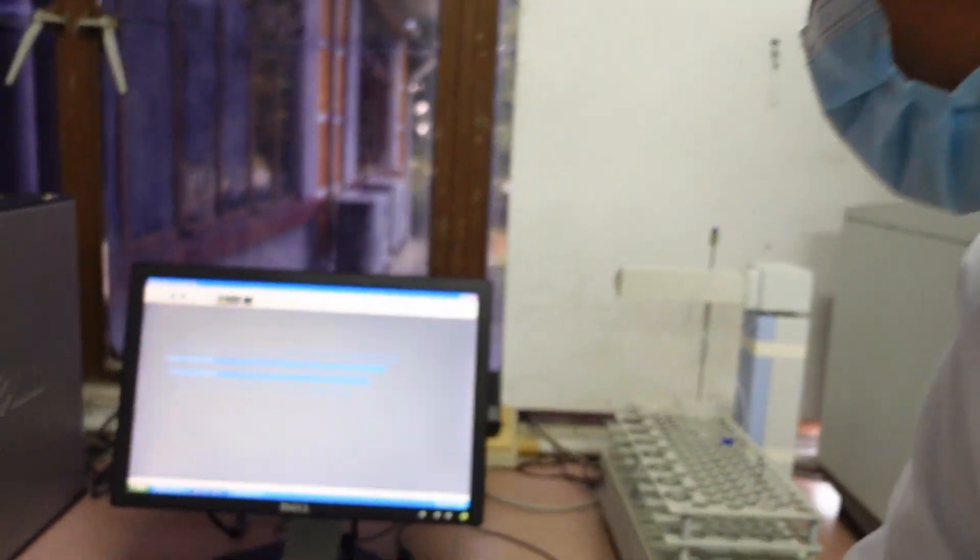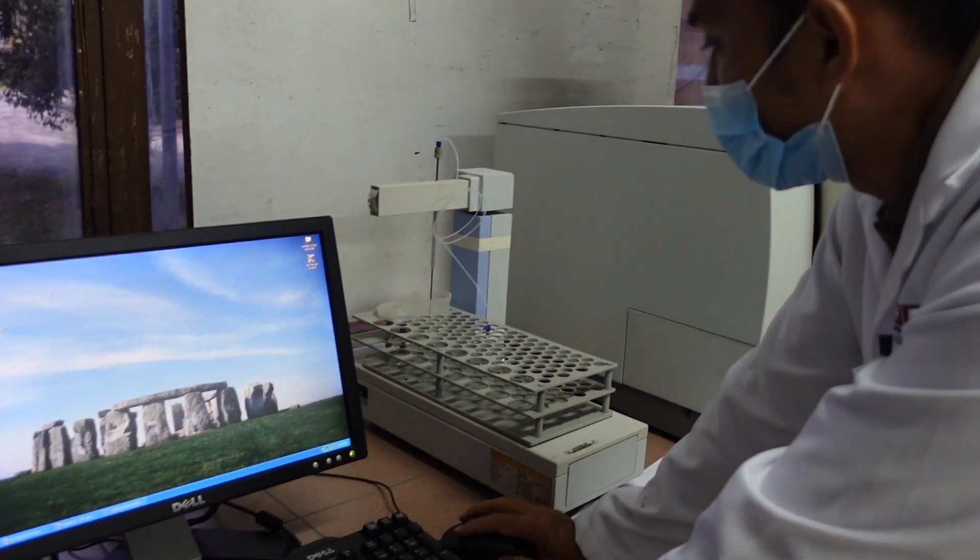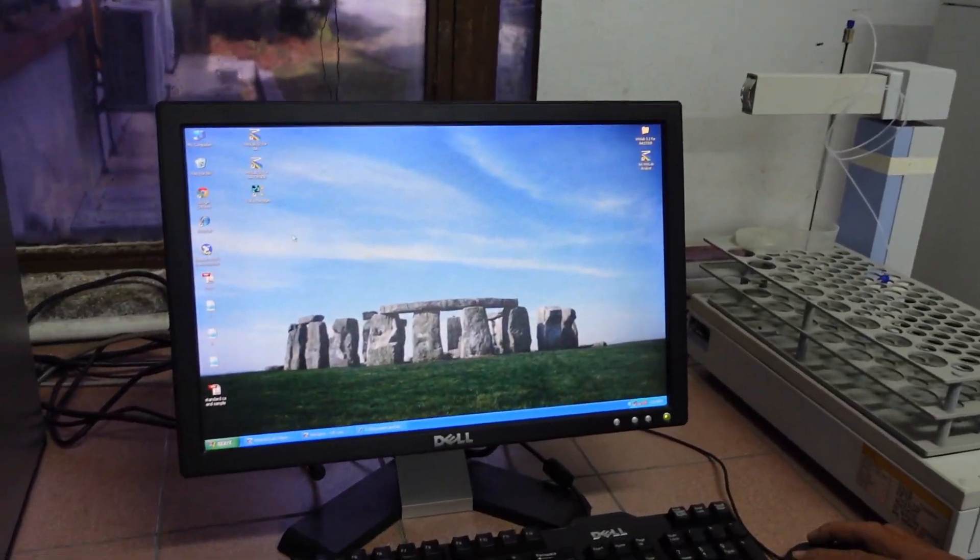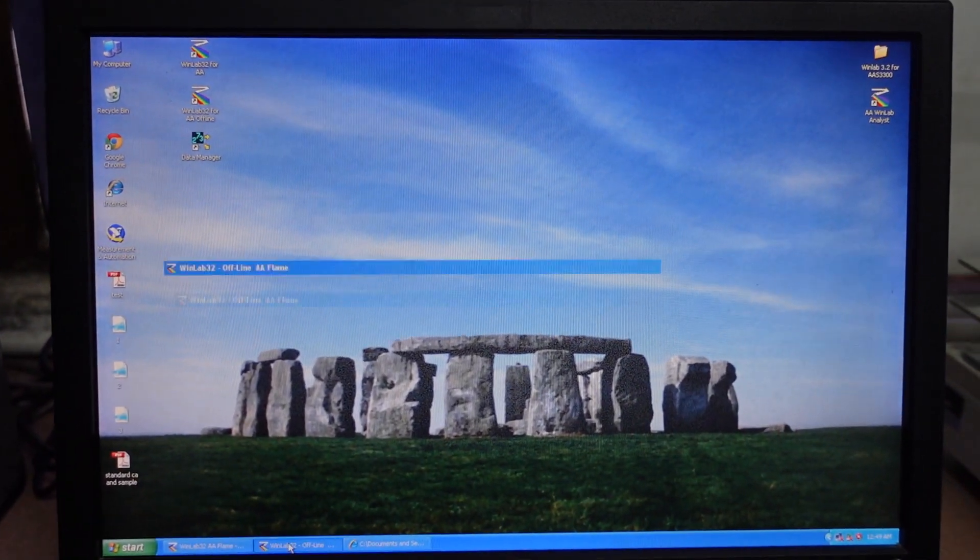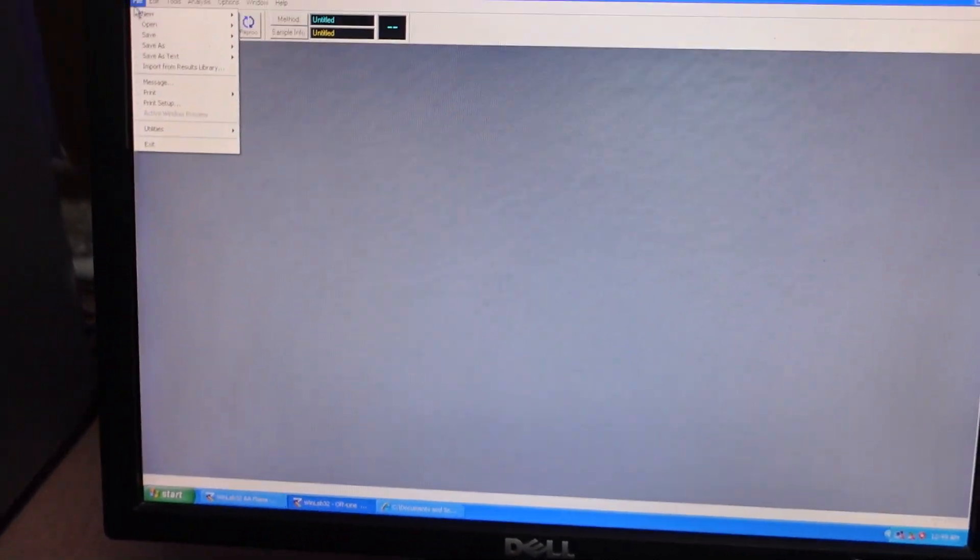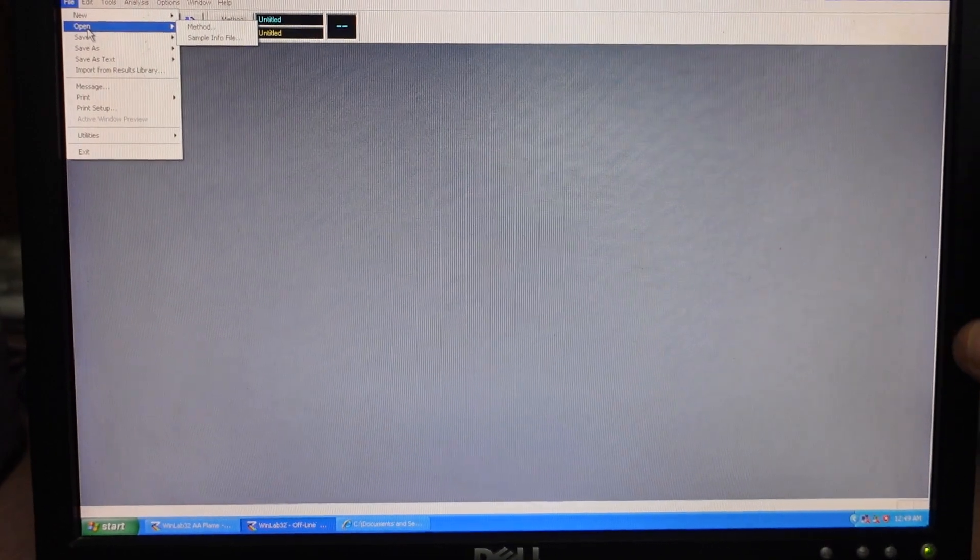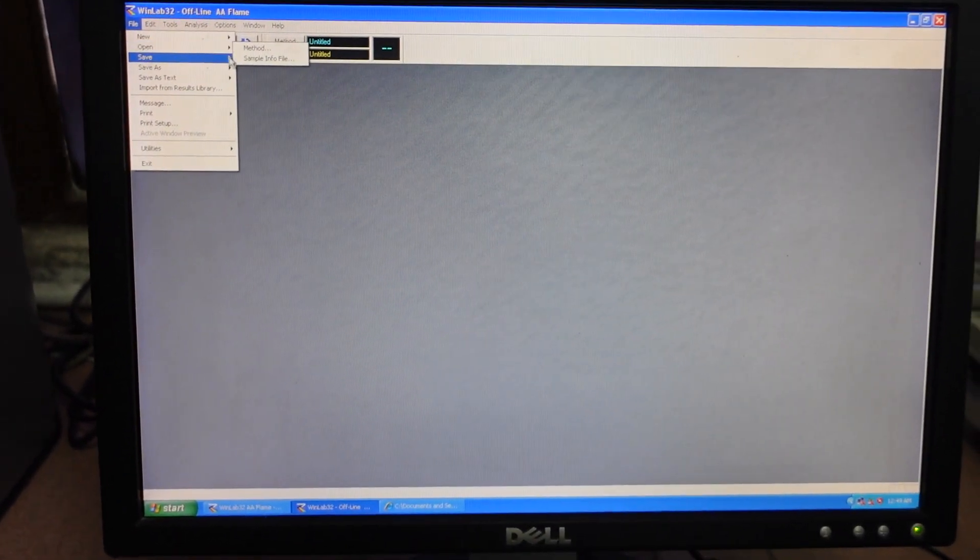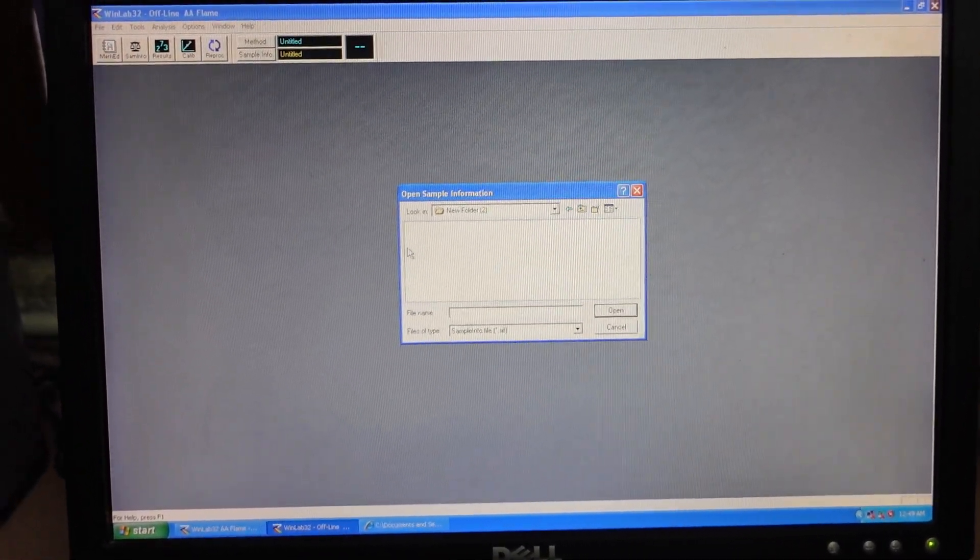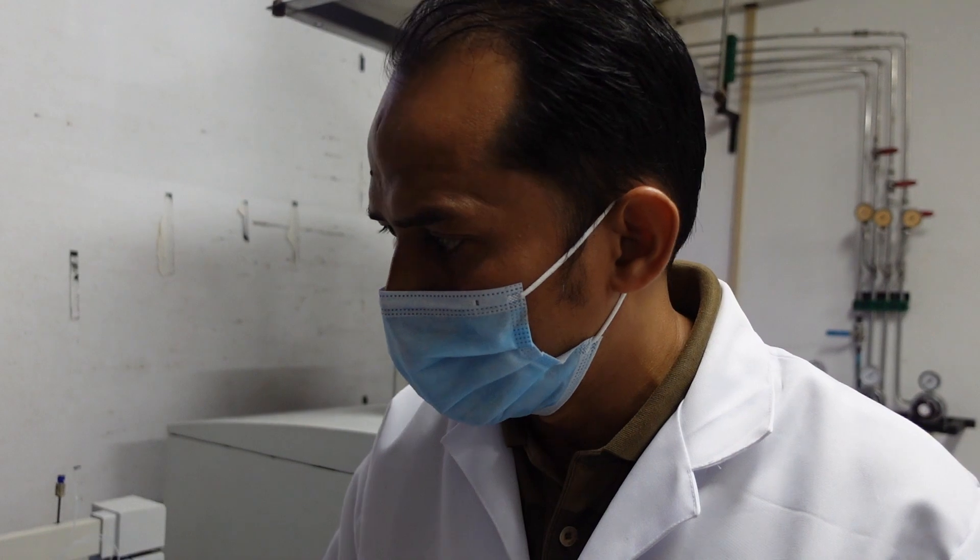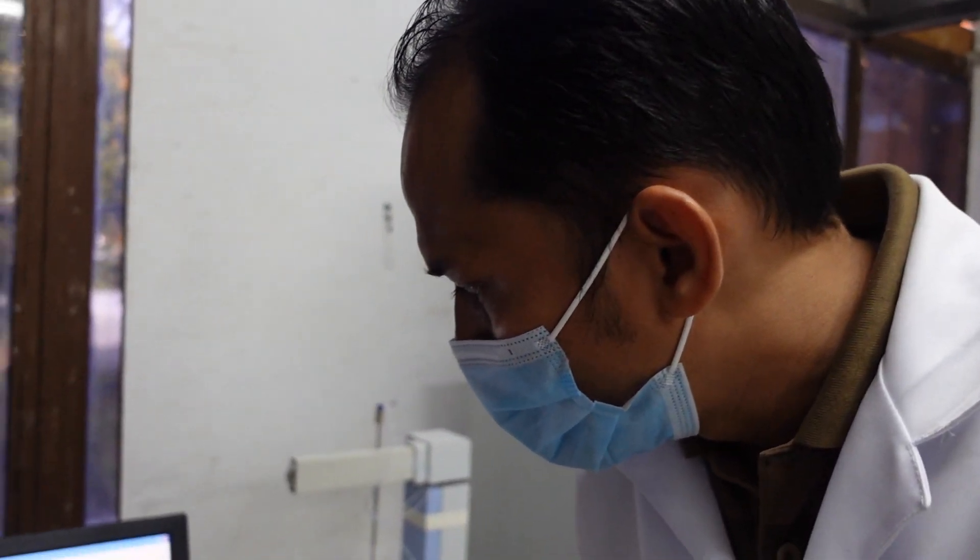In the PC, we have a dedicated PC for this machine. To run the machine, you need to open the software first, WinLab32. You click on this. You can see an interface like this. Normally we already install all the method inside the computer. Let's say you want to run calcium in milk, you just choose the method that's already installed. Open and browse your method from the system, and the system will pop up for you. Just in case you are doing some modification, you need to run the setup all over again. You have to choose the right wavelength, the right lamp, and so on. Just follow the protocol.